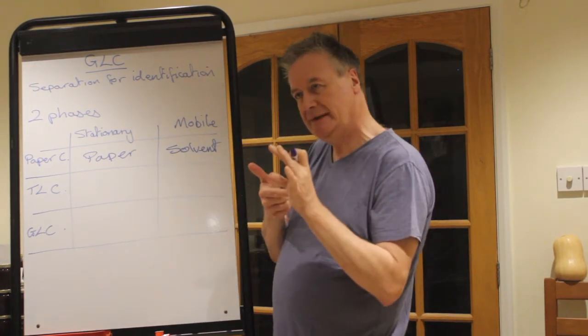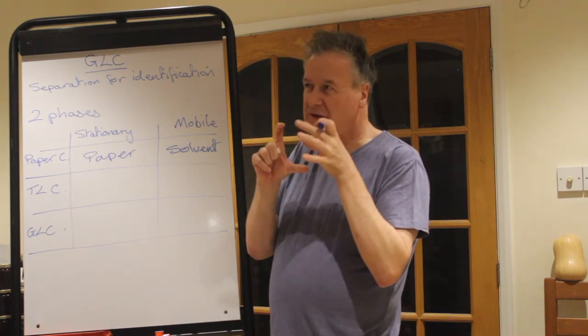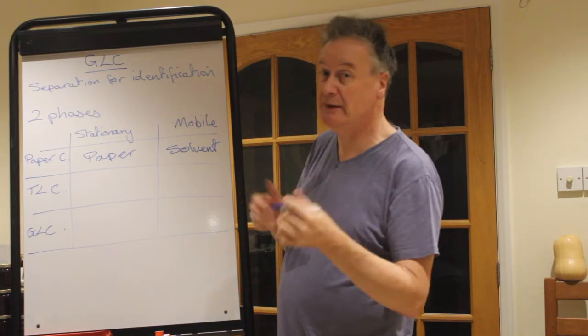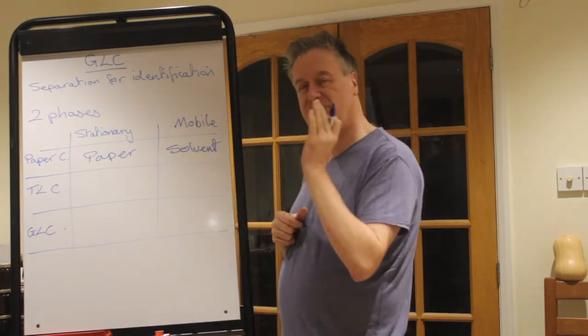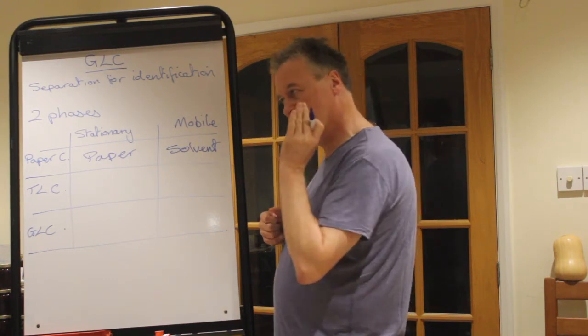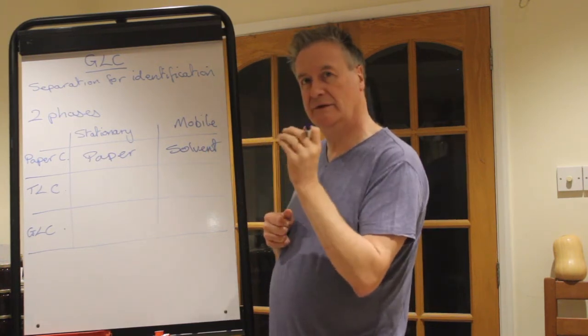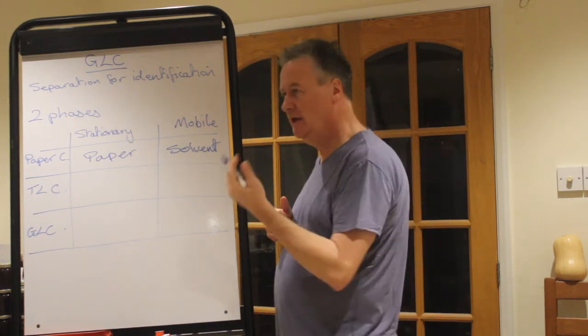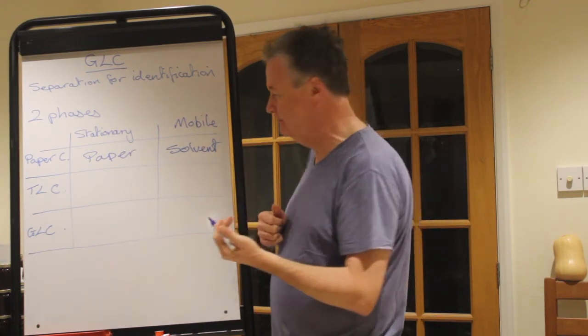It's a plastic plate, and they vary in size between 5, 6, 7 centimetres. Sometimes they're like 10 or 15 centimetres, depending on how much money you pay. And they are coated with very fine silicon dioxide, so it looks like a white coating on it that if you picked at it would powder off, which is what it is. It's a white powder adhered to the plastic backing.